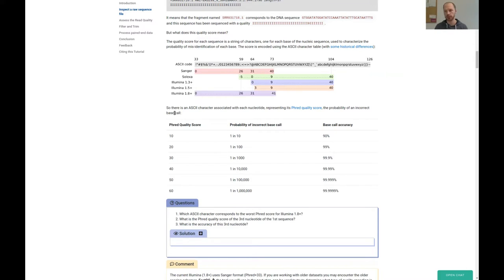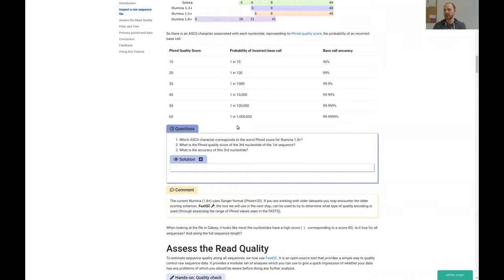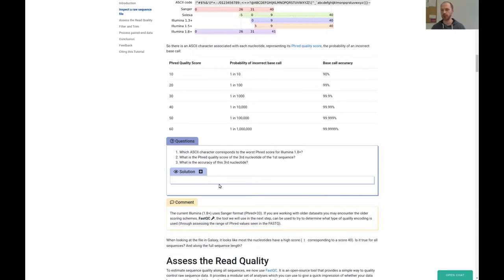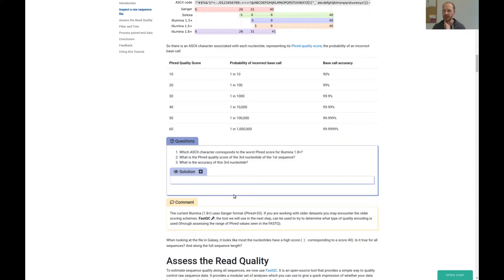The PHRED score, as I also explained in the theoretical section, is basically a number that can be translated into base call accuracy. We have three questions here. The first is: which ASCII character corresponds to the first PHRED score for Illumina 1.8+? I've kind of already answered this. The second question: what is the PHRED quality score of the third nucleotide of the first sequence? And the third: what is the accuracy of the third nucleotide?